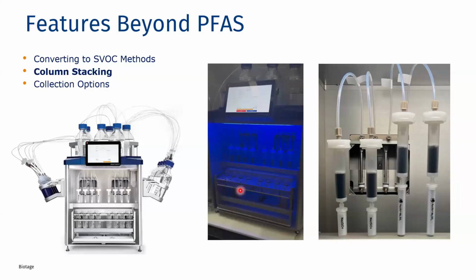But what you can do is have the system turn blue after it's done processing your sample. It'll pause and it'll wait for you to connect your sodium sulfate cartridge and then do inline drying of your extract when you go to elute your compounds of interest. So that's really, really nice, and it's a visual indicator that, hey, I'm ready to have my sodium sulfate cartridge added and move on to the next step.